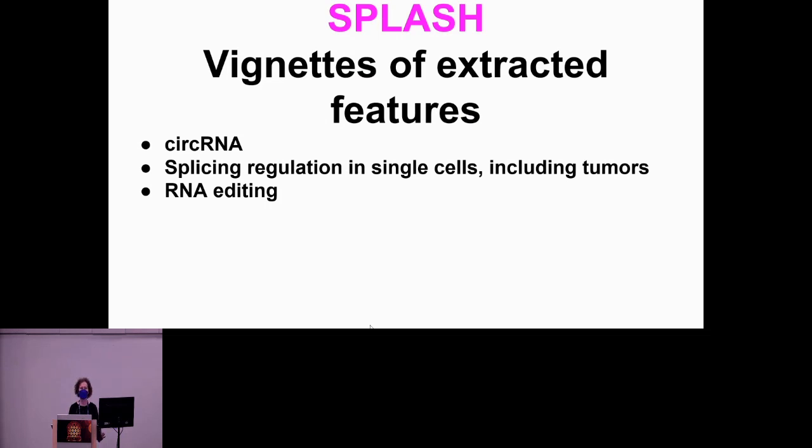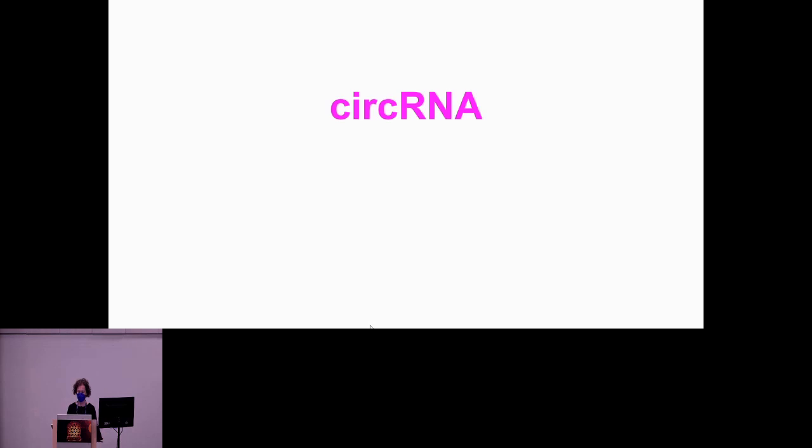And again, this is the same algorithm run with no metadata. And by that, I mean no knowledge of any genome, no knowledge of any sample type, no knowledge of the event we're trying to detect until the end. So until we say, okay, here's some K-mers, were there circRNAs in there?